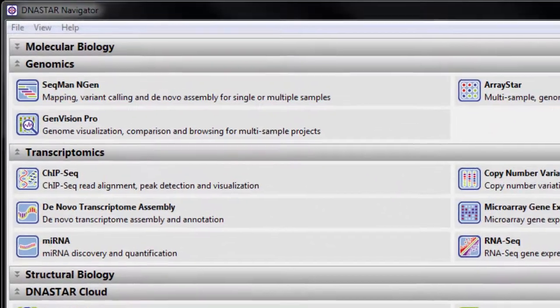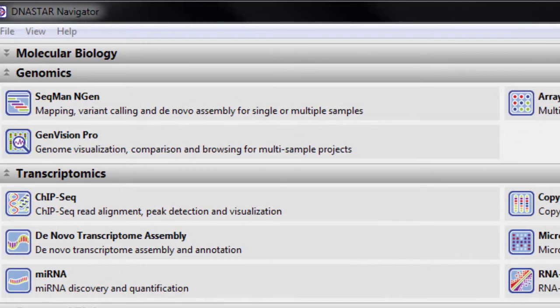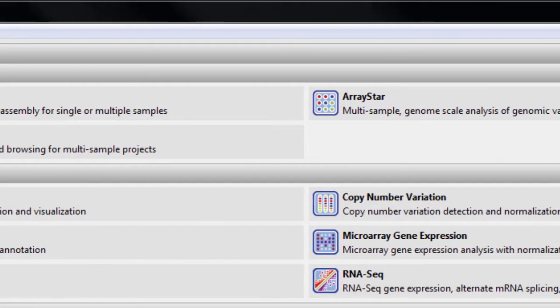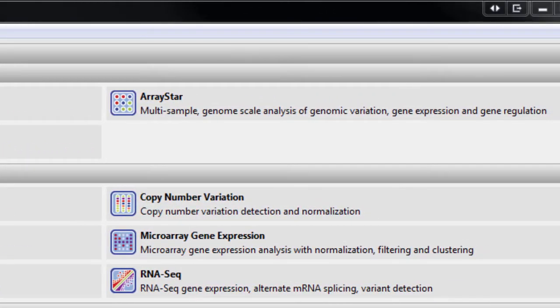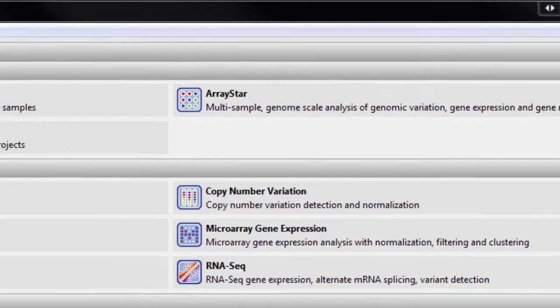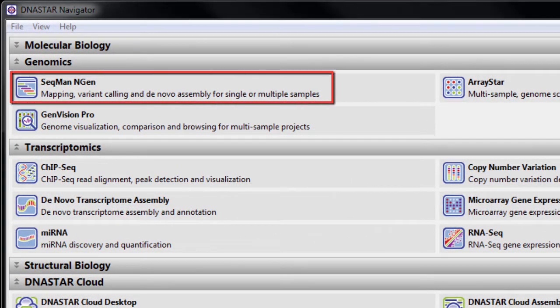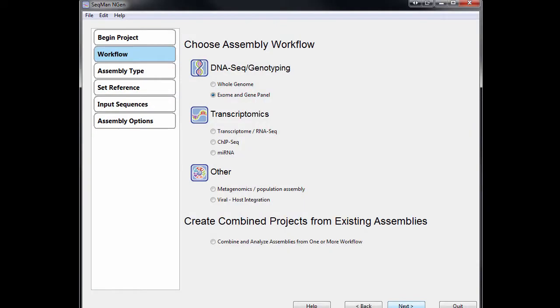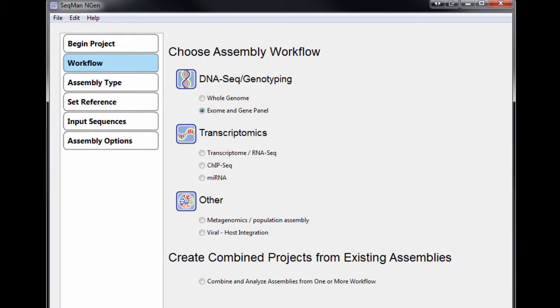LaserGene Genomics Suite includes all of our tools for next-gen sequence assembly and analysis, and supports a wide variety of project types. Most projects begin with our highly accurate assembler, SeqMan Engine, which allows you to perform de novo assembly and reference-guided alignment.